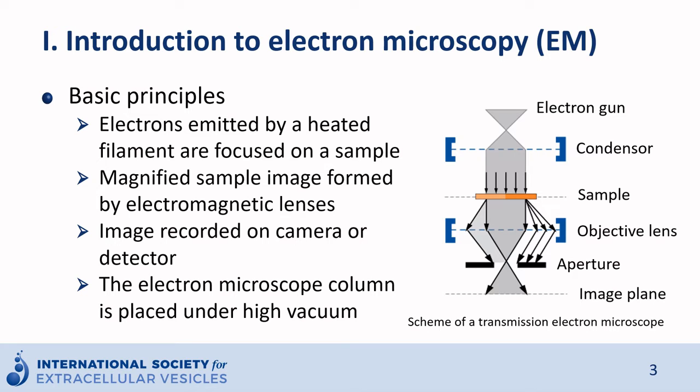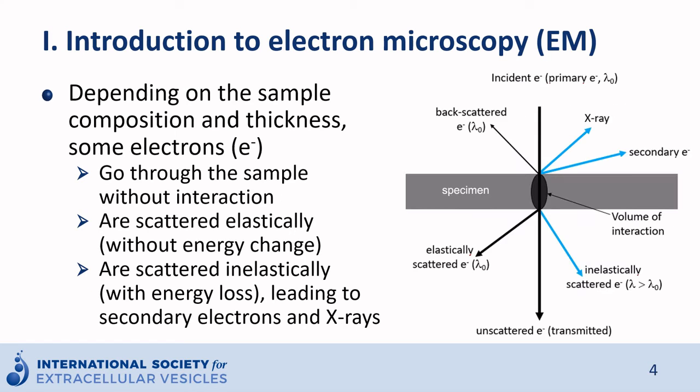It is very important to note that the electron microscope column is placed under high vacuum, and this point is critical for biological samples which are hydrated.